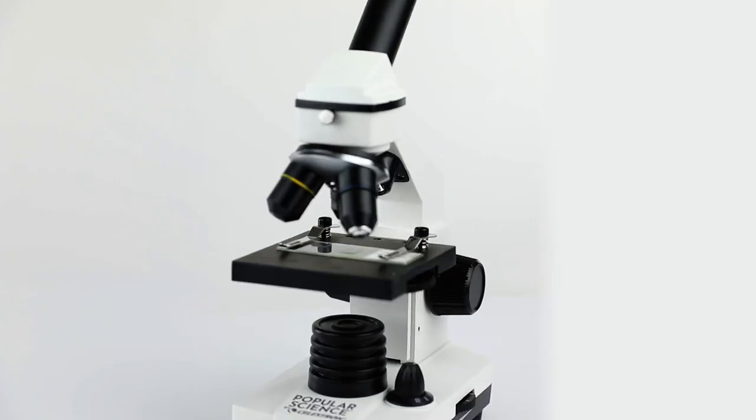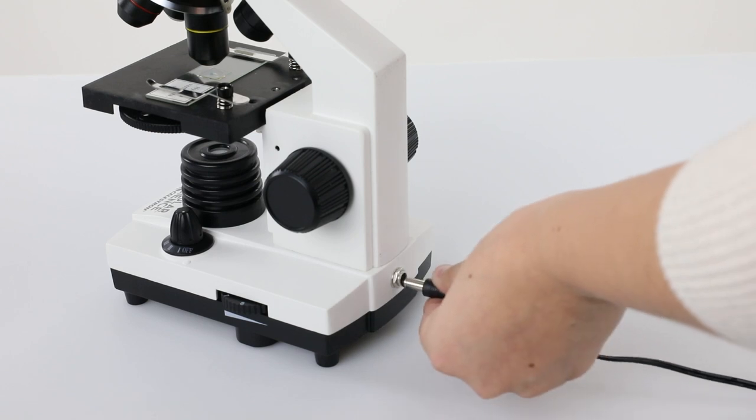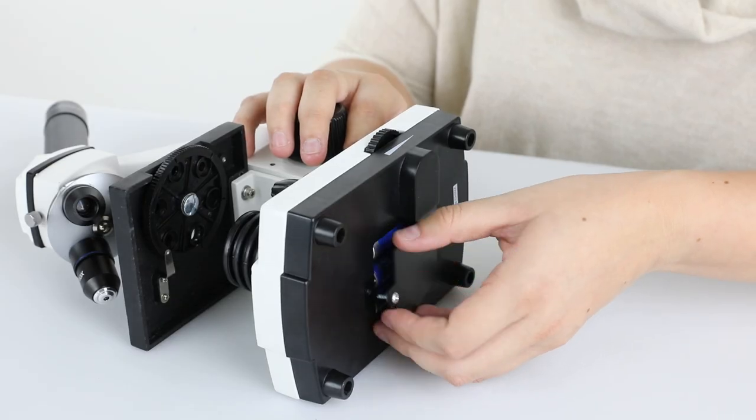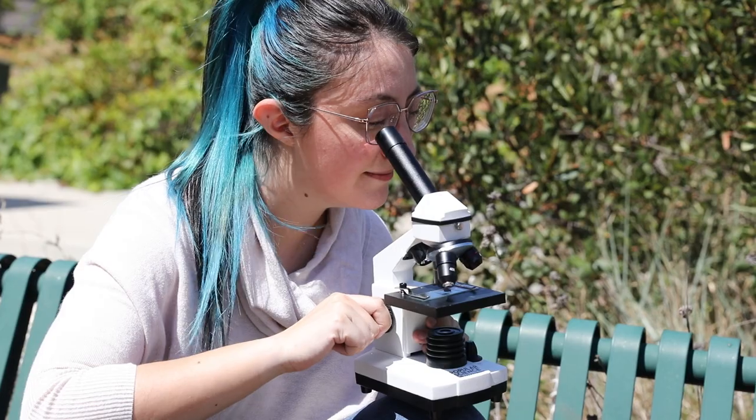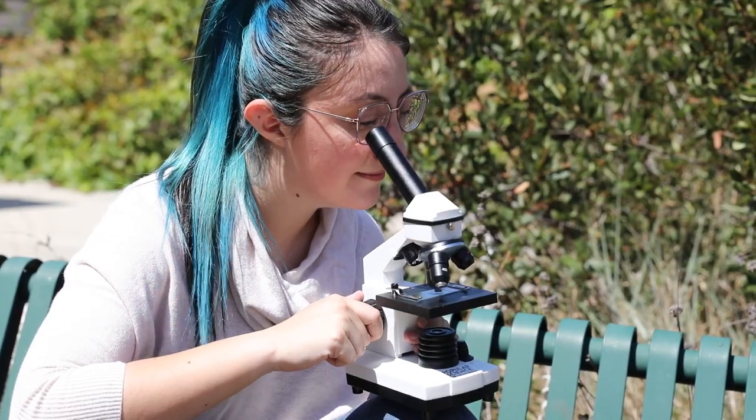With high-quality construction, this metal-bodied microscope works with AC power or AA batteries, so you can use it in the lab or take it out into the field.